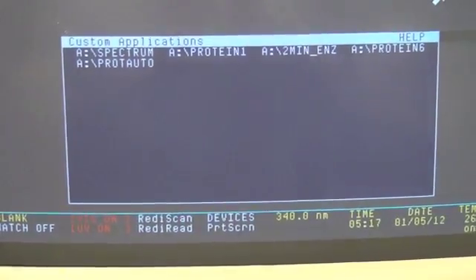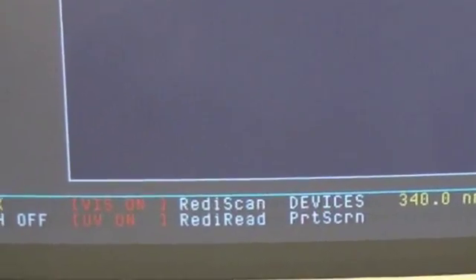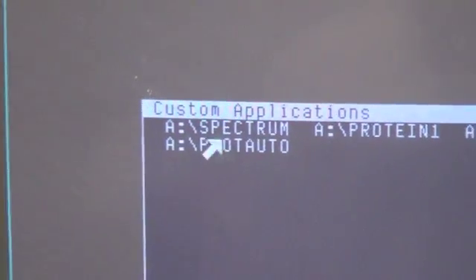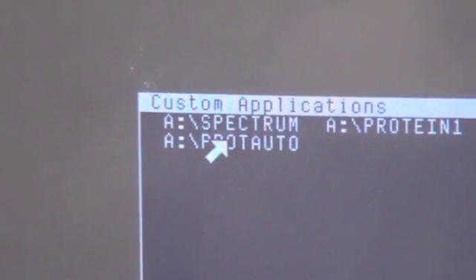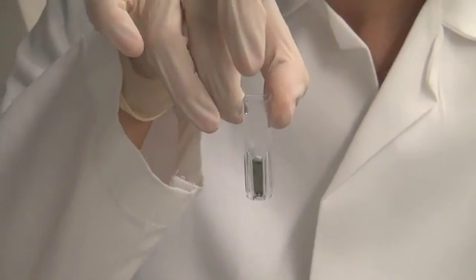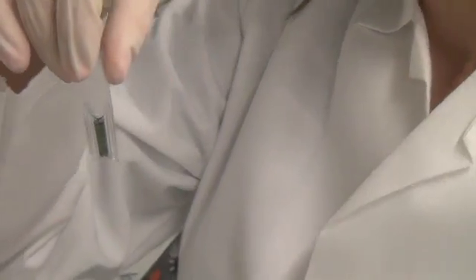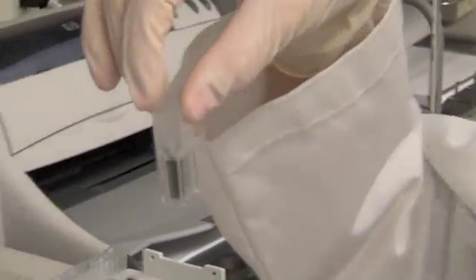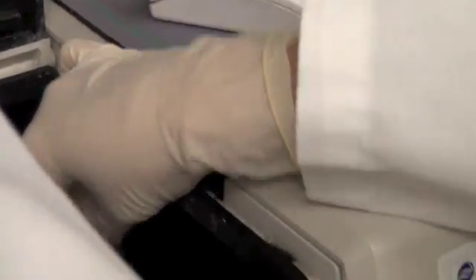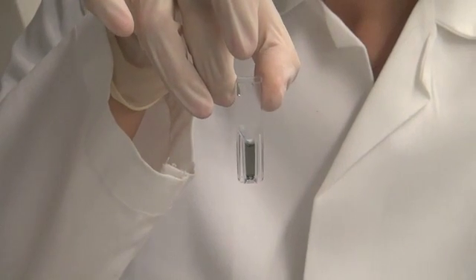Check to see that the lamps are on. Open the correct program. Also note that the bottom half of this cuvette has indented sides, so make sure you place the cuvette in the correct orientation. You can also double check to make sure the orientation is correct by looking for the arrow on the top of the cuvette.